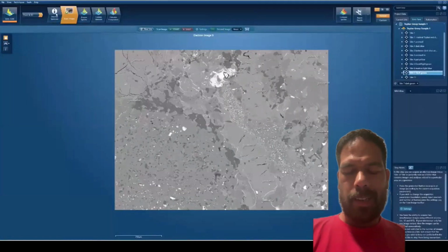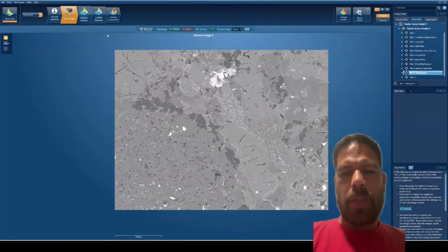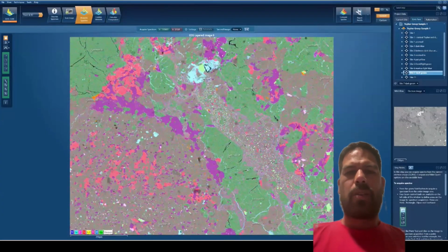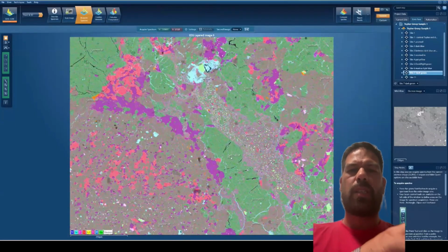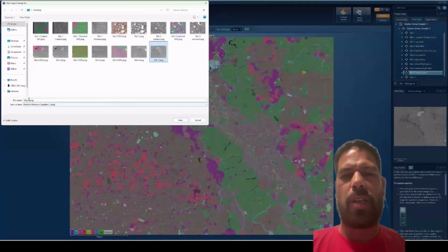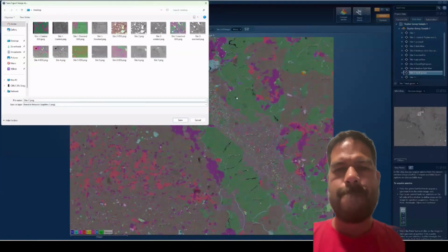Hey, thanks. So I had a question for you, Daniel. You mentioned you want to get representative sample sizes for the material that you're looking at. I know you're interested in lunars and things like that, some of which are polymict in nature. So say this sample that they had is polymict in nature. How many samples do you need per lithology to really dial things in? Because like I said, time is precious when you're on the SEM. So what do sample sizes look like for something like this?